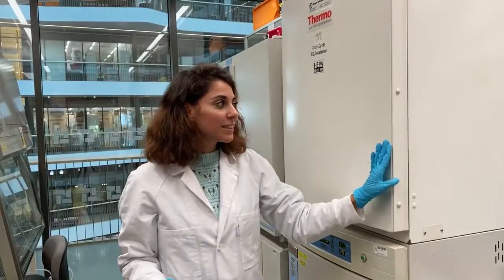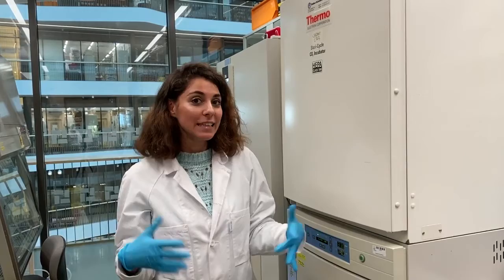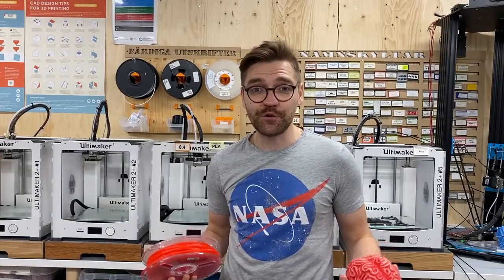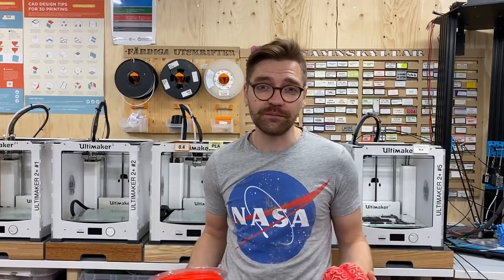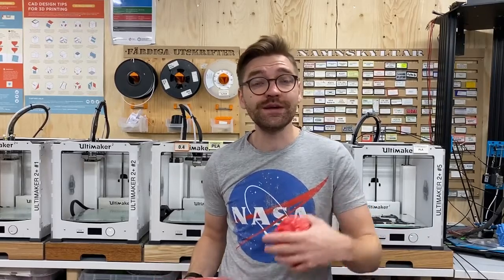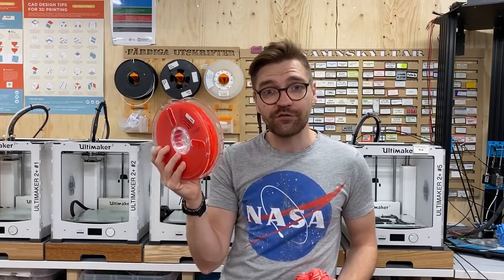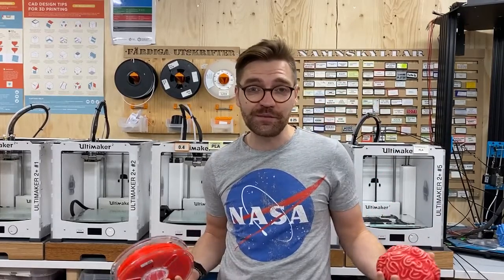But of course, this is only 2D and it's not so relevant, so we need to take it to another dimension. As makers, I'm sure that you already know what a 3D printer is, like the one behind me, and this machine could solve one problem, going from 2 to 3 dimensions and creating tissues for scientific research. However, our bodies are not stiff and made of plastic like this standard 3D printing filament, they're a bit more soft like this. So how can we tackle this problem?